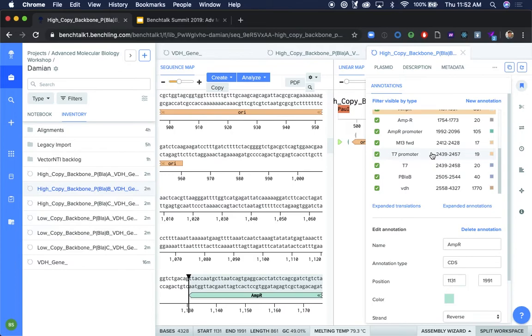Another thing to keep in mind is that if you're bulk assembling fragments that were pre-annotated, those annotations will be kept, right? So if I had done this with those annotations, you would have seen them automatically. I just wanted to demo these here.